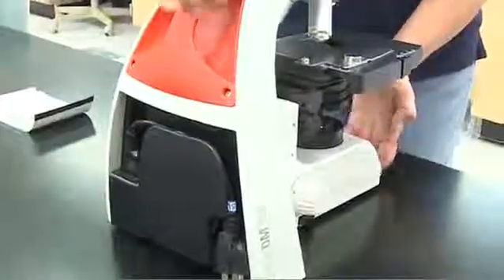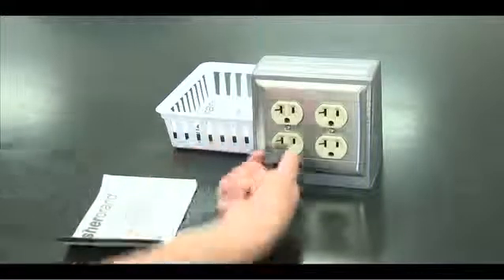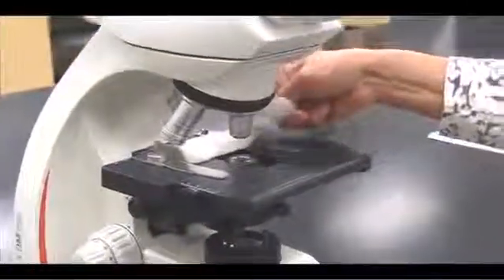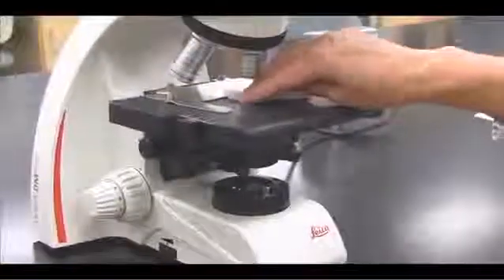Carry the microscope by the arm and the base. Plug in the microscope. Clean the oculars, objectives, condenser, and illuminator with lens paper.